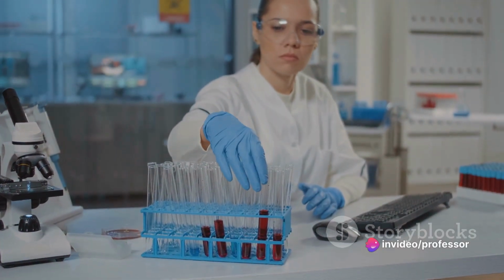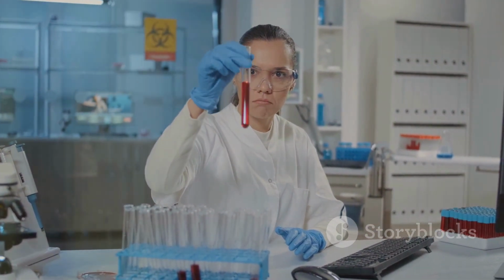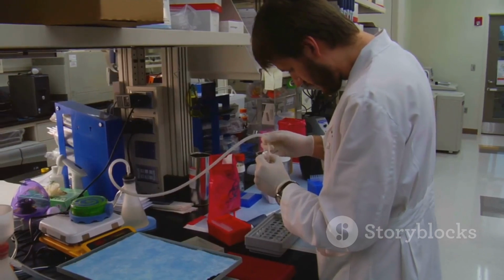Remember, the beauty of conductometry lies in its wide-ranging applications, from analyzing solutions to monitoring reactions, and even in environmental testing. The understanding of this field paves the way for scientific exploration and discovery.